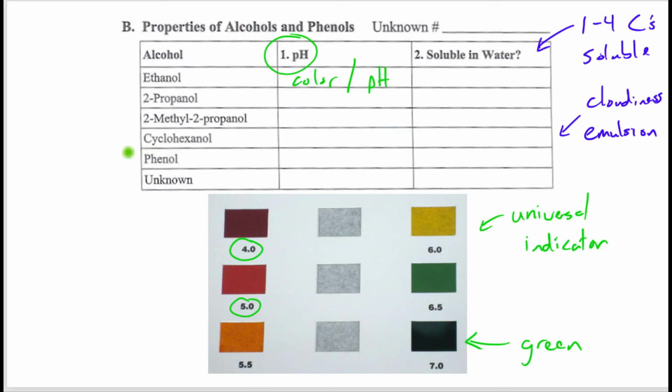Let me go ahead and discuss one particular alcohol. Let's look at the phenol group here. Phenol is our aromatic alcohol, and it does something that is unique, at least with respect to these particular alcohols and most alcohols. It actually undergoes a hydrolysis reaction like we saw back in Chapter 10 with acid-base chemistry.